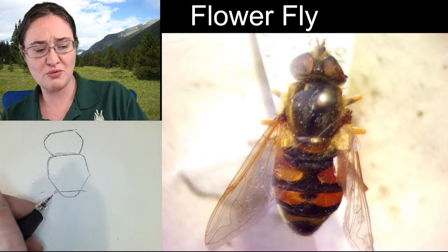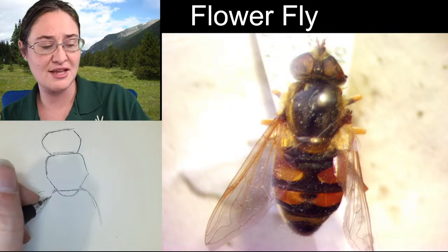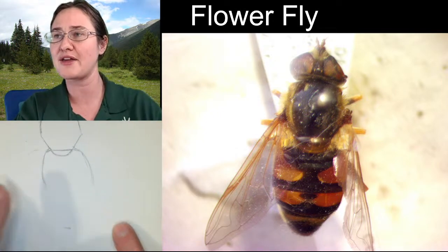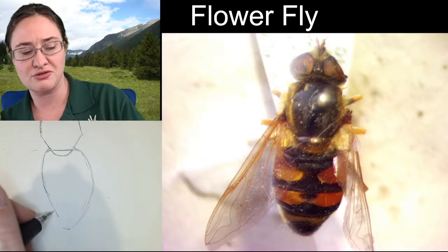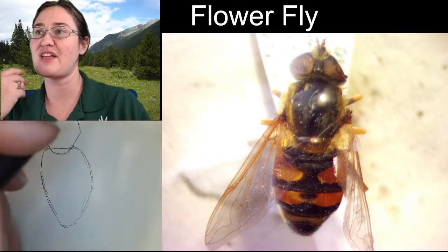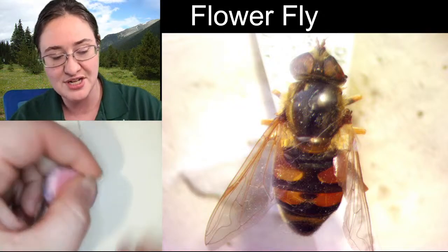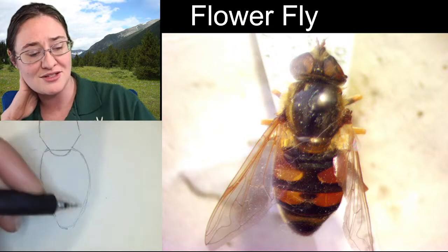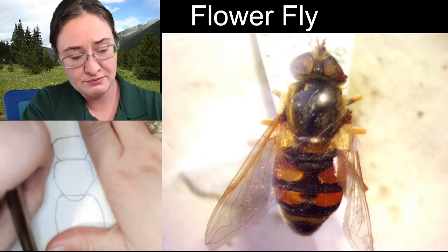All right, so we've got this abdomen coming out from the edges. The first and the second segments of the abdomen are generally pretty parallel on either side. And then once you get past that, it starts to narrow strongly until you get to the bottom. This is why a lot of people feel like these guys look like bees, because they look like they could even have a stinger, right? But they don't have a stinger, and they're super duper nice, and they're helping our pollinators. So we don't have to worry about them at all.